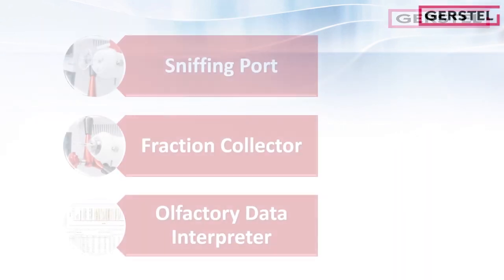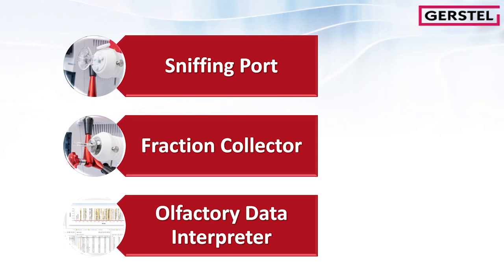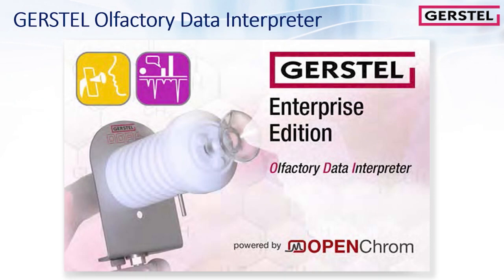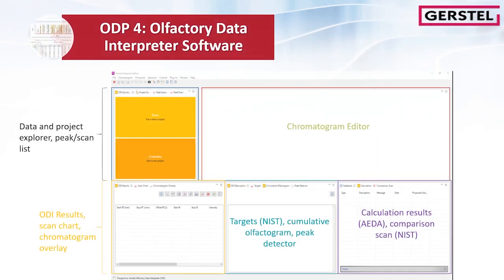In the last section, we take a look at the ODP Data Analyzer software. The olfactory data interpreter is based on the Gerstl Enterprise Edition powered by OpenChrome. The OpenChrome Gerstl Enterprise Edition arranges views in perspective. The concept supports certain kinds of views on your data, and windows can be rearranged, maximized, and minimized depending on what you actually need.